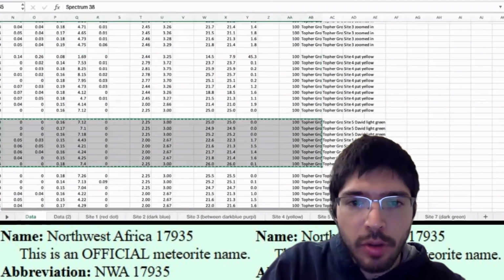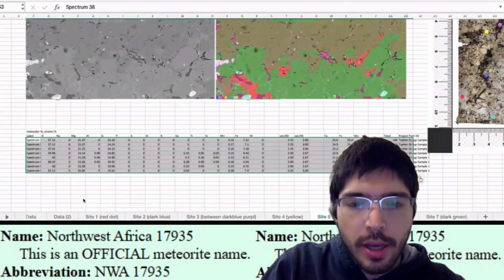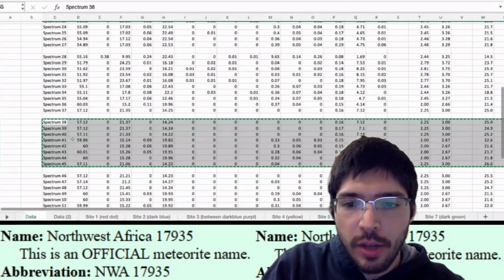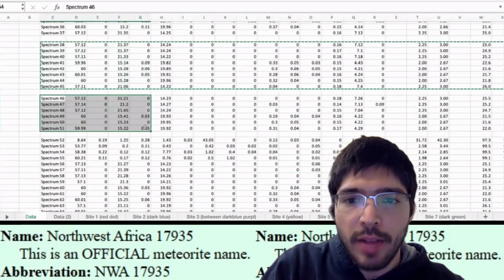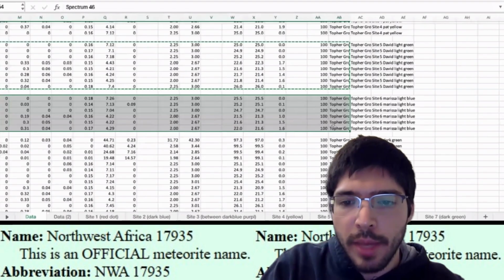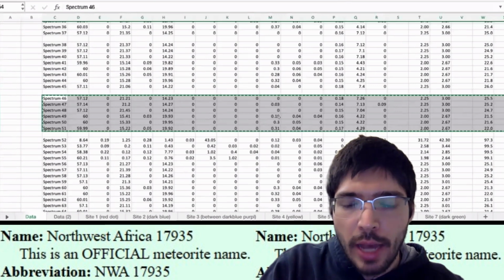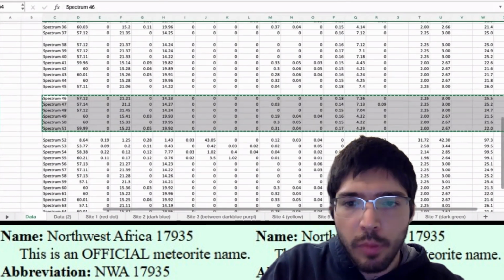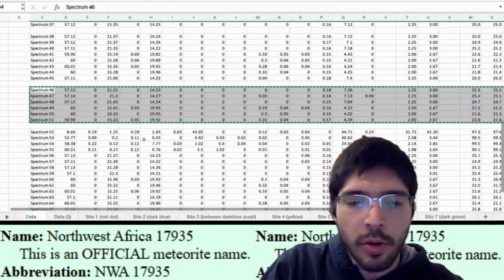There are certain ways that you could actually observe the weathering in metal up close using chemical data. If you analyze a metal, there are certain features you'll see during weathering. The first is that you're not getting a clean spectrum, so you're not seeing just iron and nickel. You start seeing oxygen showing up, and then you see things like silicon, and then some of your totals drop off. So chemically, you can actually see weathering, iron hydroxides in altered metal.